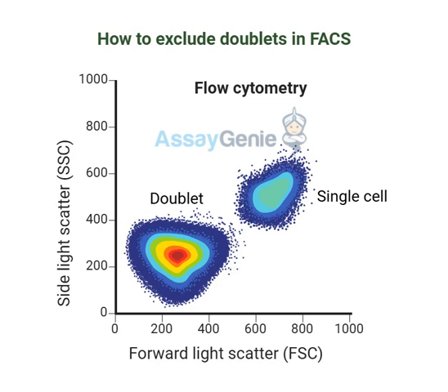Scientists are also creating these incredible new fluorescent markers. Markers. Yeah, the things that make the cells glow. They're making them even brighter and more specific, which means they can tell different cell types apart even better. Hold on, even brighter colors. What's the advantage there? Well, the brighter the color, the easier it is to see it, right? It makes it much easier to tell different colors apart. And with these new markers, scientists can track specific cell populations with amazing precision and sensitivity.